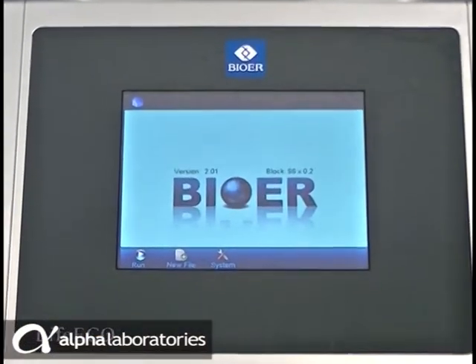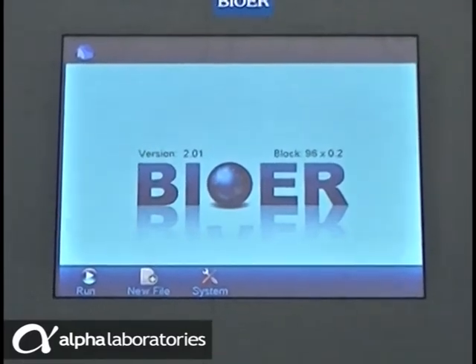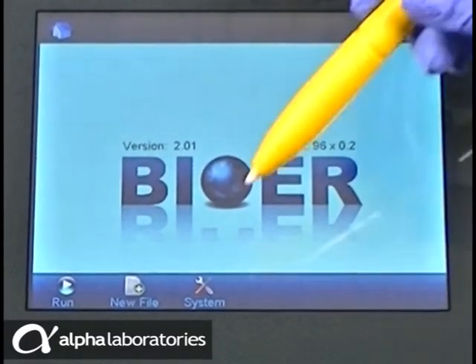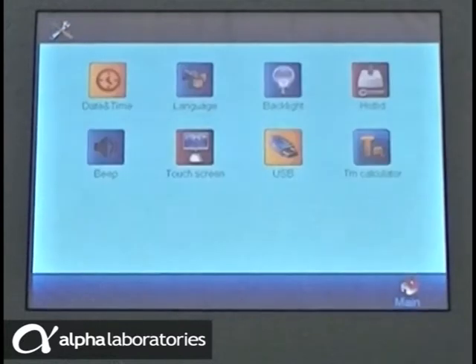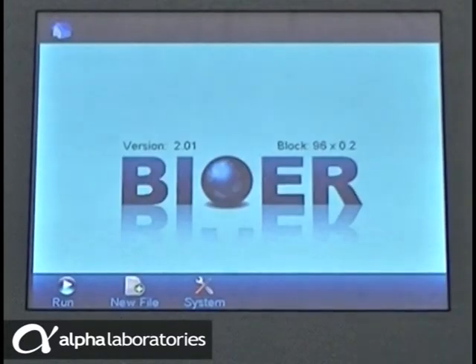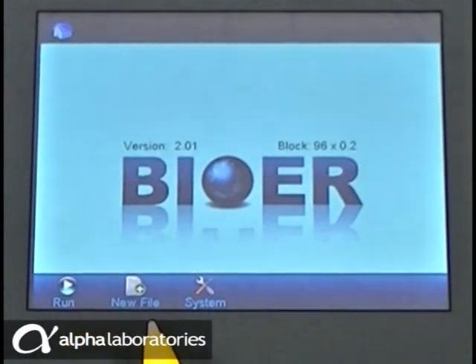Programming and operation can also be controlled directly from the full color touch screen interface using the stylus or manually. The home screen features three simple options: Run to select and start an existing PCR protocol, New File to create a new method, and System to modify the instrument's settings.